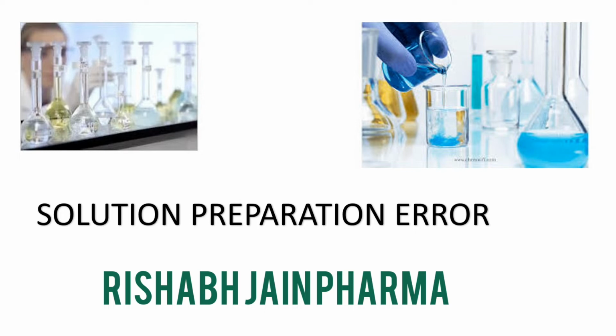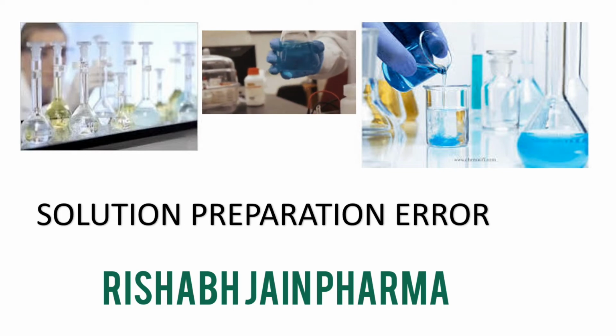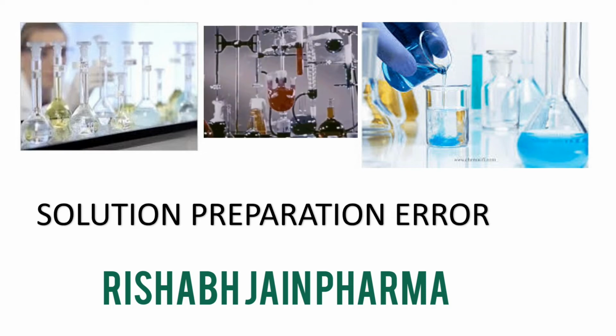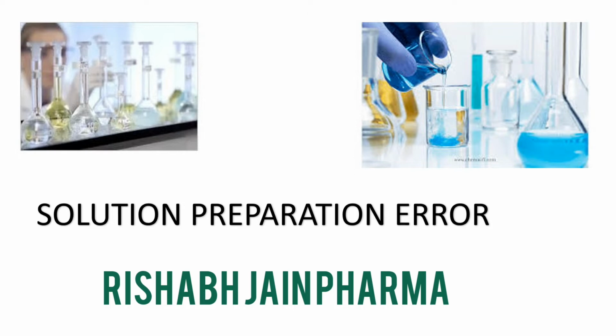That area is solution preparation. If you want to analyze any product in any instrument, like it may be HPLC, it may be UV, it may be a Malvern particle sizer, everywhere first you have to prepare the solution. Then this solution has to be injected in the HPLC, or analyzed in a different instrument. But this solution preparation is very important.